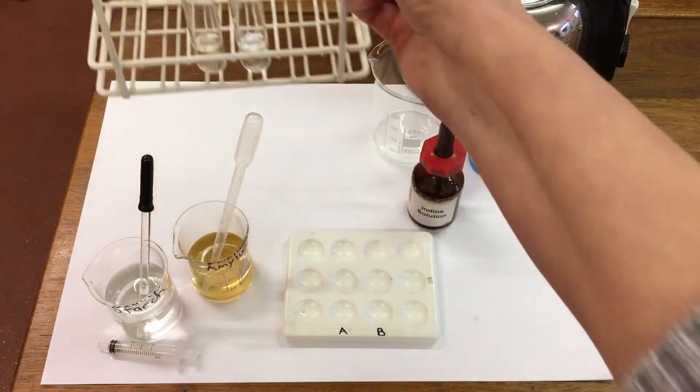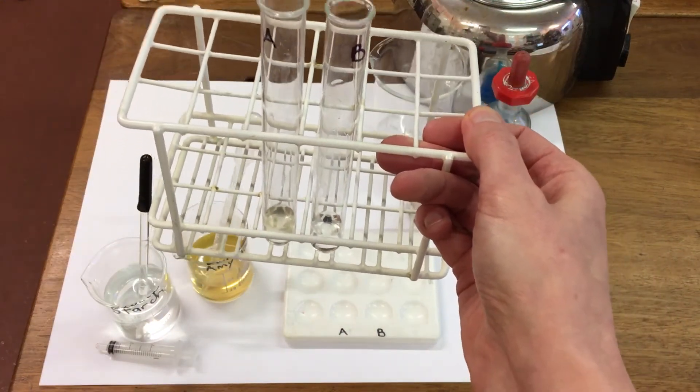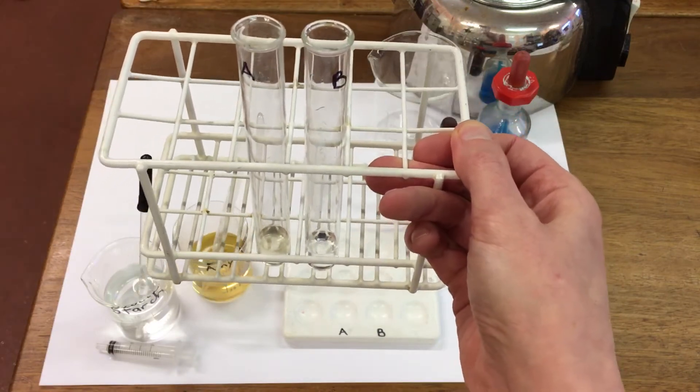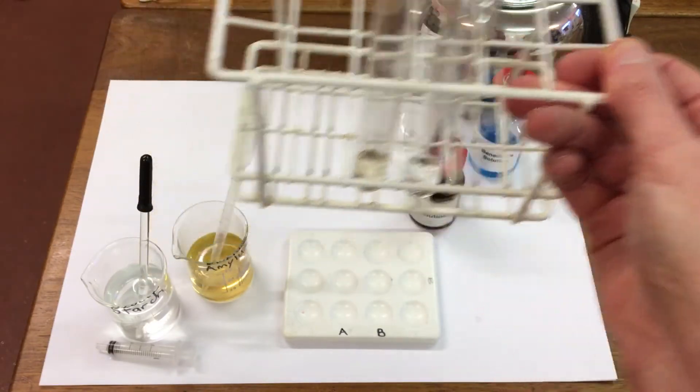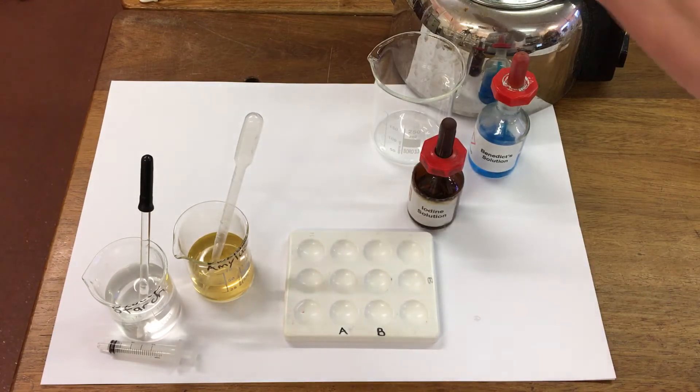So in test tubes A and B, I've got 2 ml of starch. A has our enzyme amylase and B has water. We're going to leave these tubes for approximately one hour and then test them to see the results.